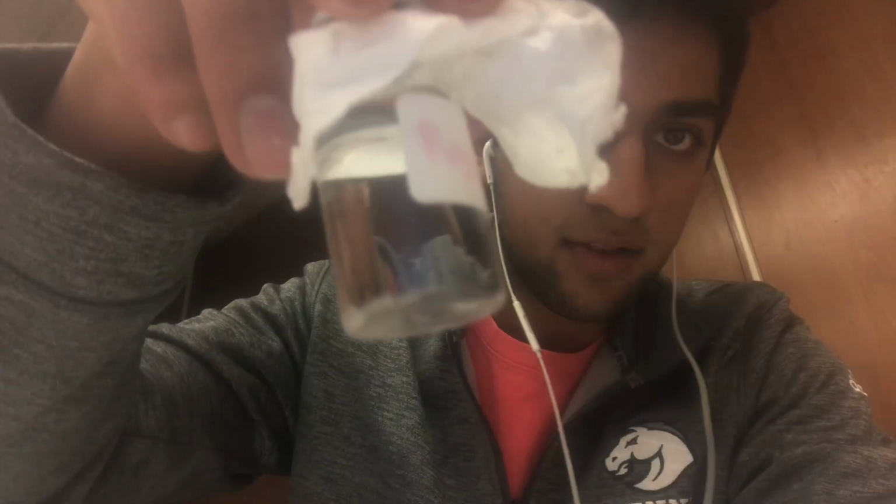So after about a week of lab, we have a few crystals at the bottom of the vial, as you can see. Not a large amount of growth, however, it is some progress. I expect that next week there will be a significant amount more of crystals, but we'll see.